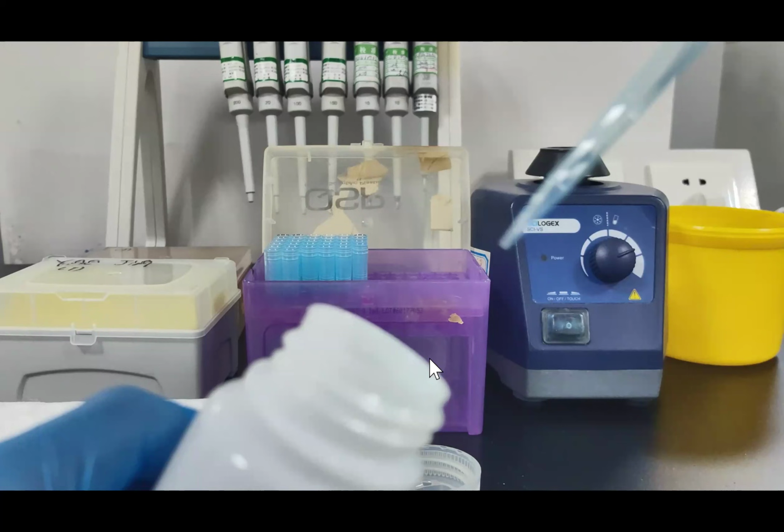The instruction of the test reagent will tell you how many reagents you need to add, how many samples you need to add, and how much lyse you need to use. Just note those numbers and find the pipette.